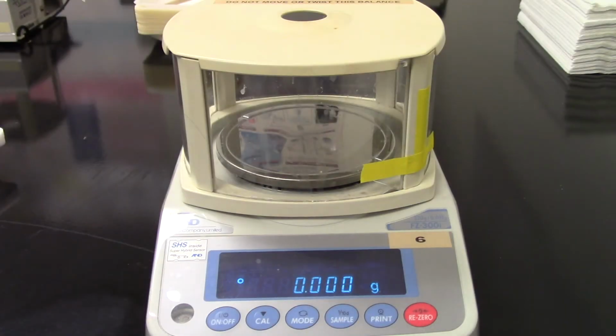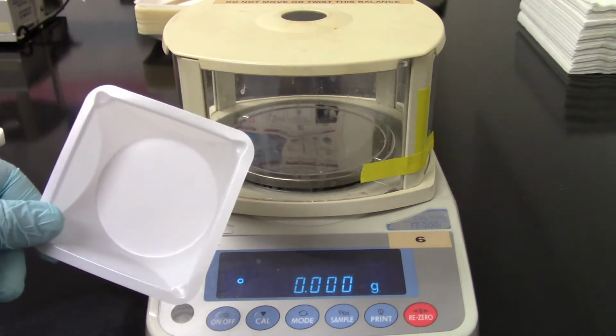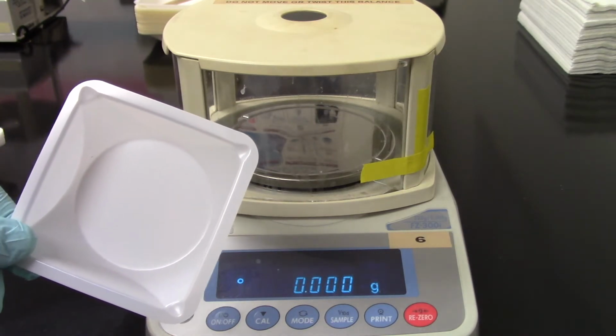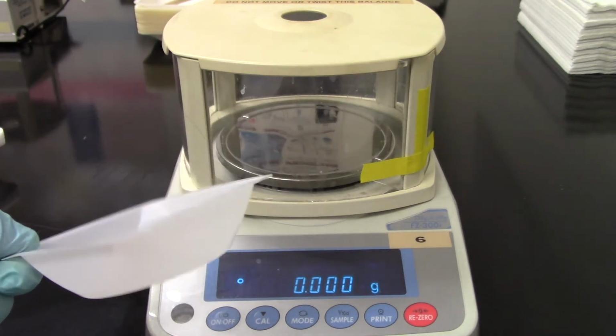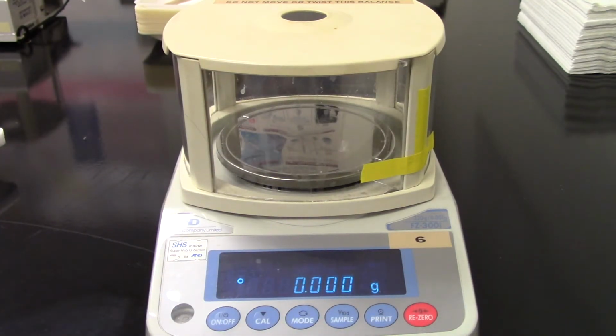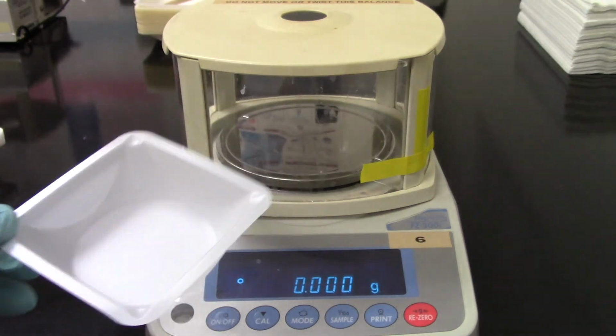Now we're going to do part 4, measuring mass. This is a digital balance, very nice balance actually. I'm going to put on top of the tray this little device called a weighing boat. Now I don't care about the mass of this boat. The mass of this boat is irrelevant to me. So I'm going to zero it out using the re-zero button, and the computer inside the scale will just subtract out the mass of this tray.